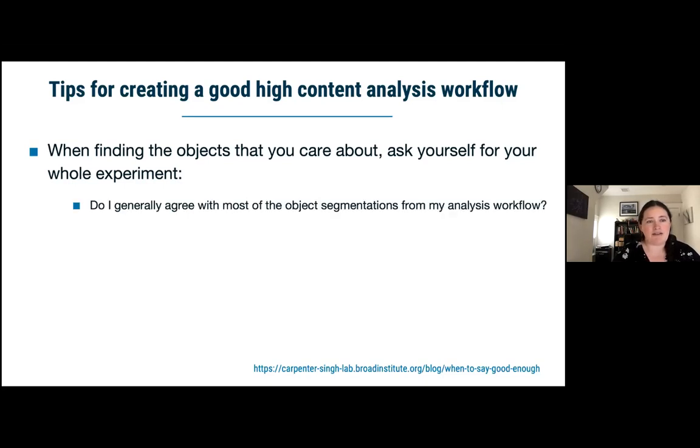And I'm not going to do a demonstration necessarily of how you do that, but I'm going to share with you the general principles that I encourage everyone in my group, and definitely also my past self who wasn't always good at these, on how to figure out when you should stop tuning your analysis workflow and when you should actually move on and start using it in practice. The first is just, do I generally agree with most of the object segmentations in my analysis workflow?